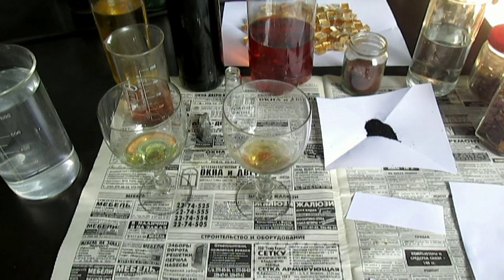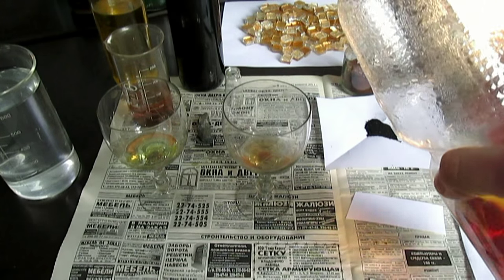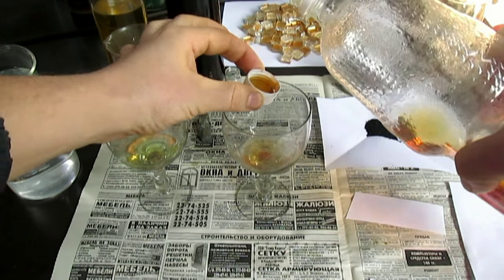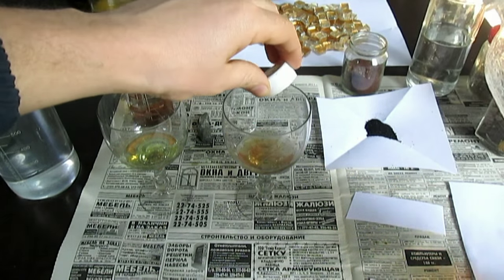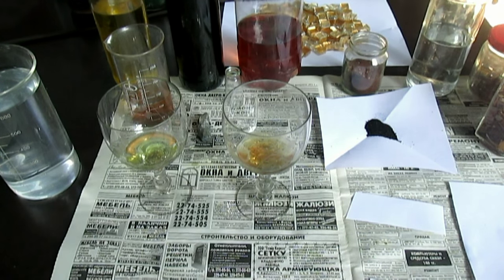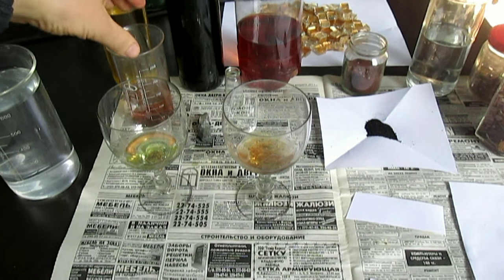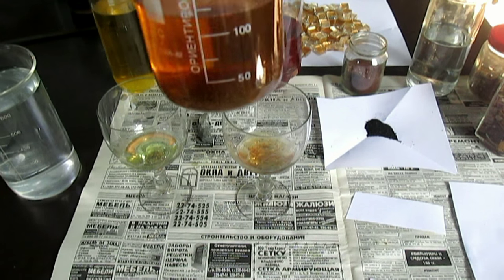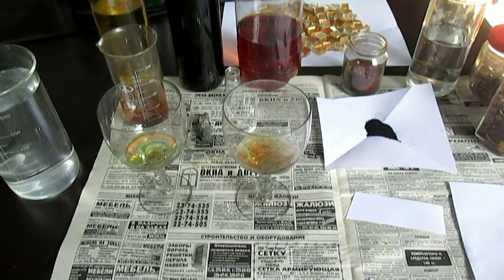Можно ещё добавить — быстрее будет растворяться. Это золото я доработаю, потом выделю осадок при помощи вот этого восстановителя, который туда насыпал. Это моё золото — в конце видео покажу. Когда осадок выделю из него, я его растворю в царской водке и покажу вам, как уже железо, к примеру, прореагирует, как все привыкли.